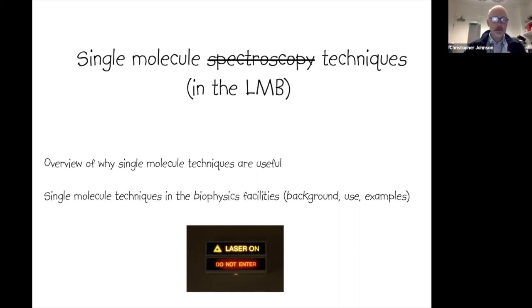biophysics facilities. So the talk's going to be divided into two sections. First of all, an overview of why single molecule techniques might be useful in your research. And then in the second half of the talk, I'll describe these techniques which we have available in a biophysics facility, giving you some background to how the techniques work, how you would actually practically use them, and hopefully some examples of where they've proved to be useful during research.